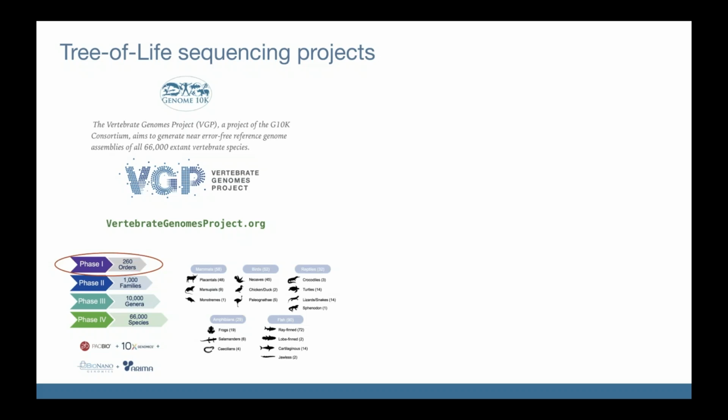And for this first phase, we've sort of thrown the kitchen sink at the problem in terms of technologies. For each ordinal genome, we're doing PacBio, 10x, BioNano, and Hi-C as well.